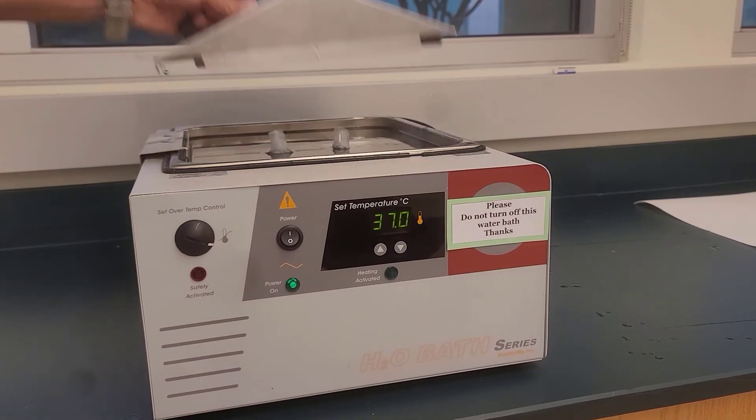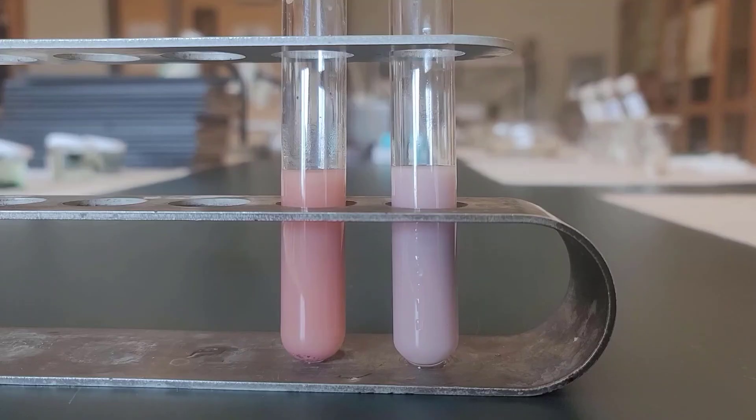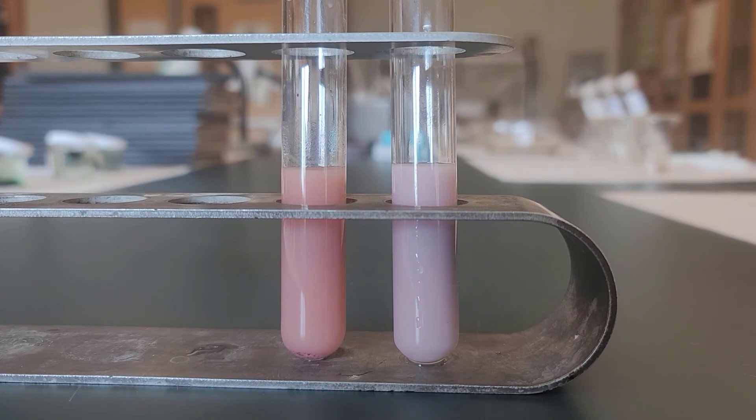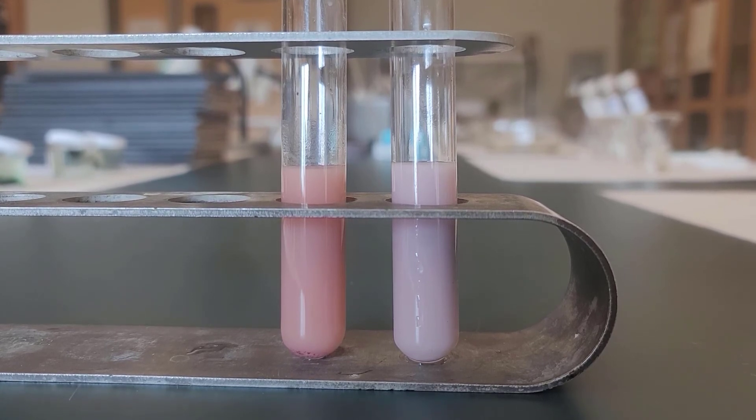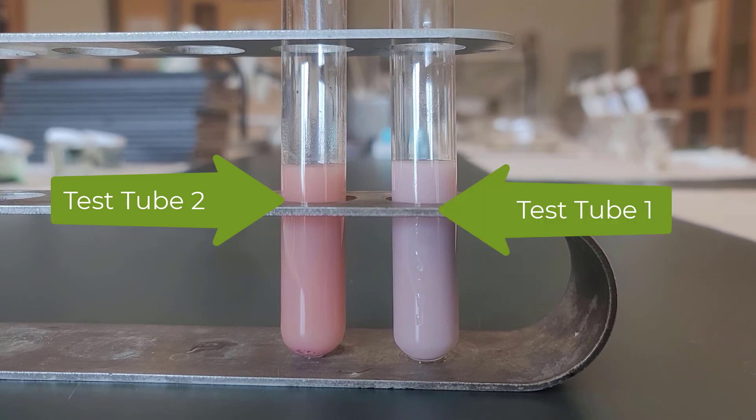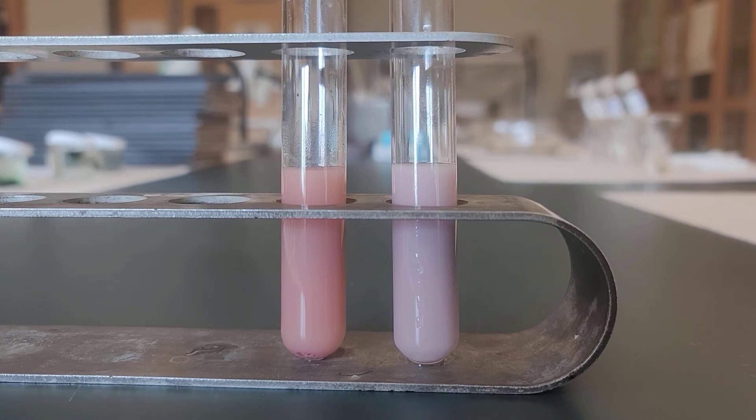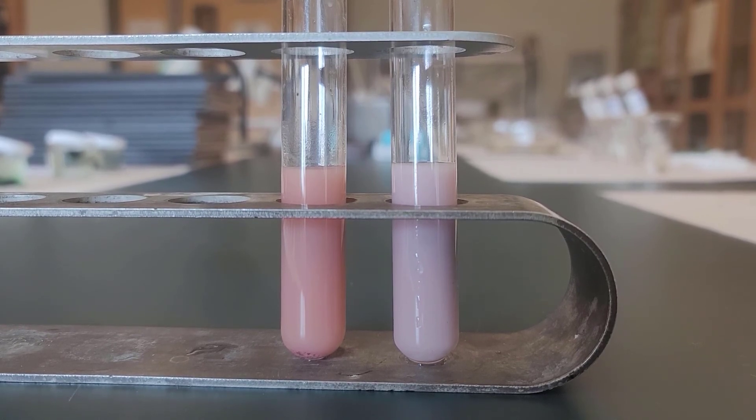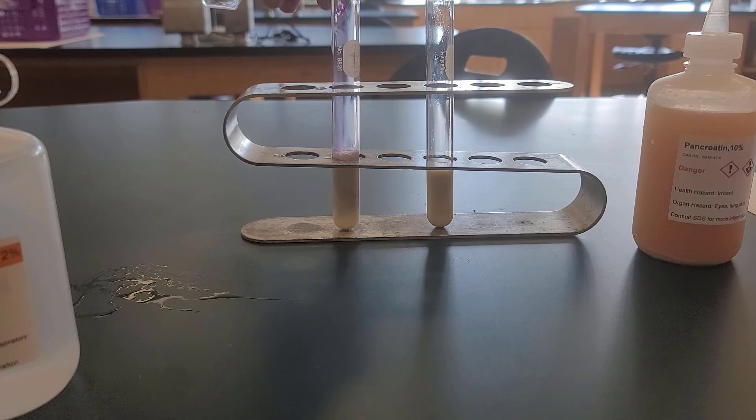When we take the tubes out, this is what they end up looking like. And it's a little subtle and maybe a little bit hard to tell, but hopefully you can see that test tube two is a little bit more red or a little bit more pink than test tube one, which is a little bit more on the bluer side. So that's the results of the classic pancreatic lipase experiment.